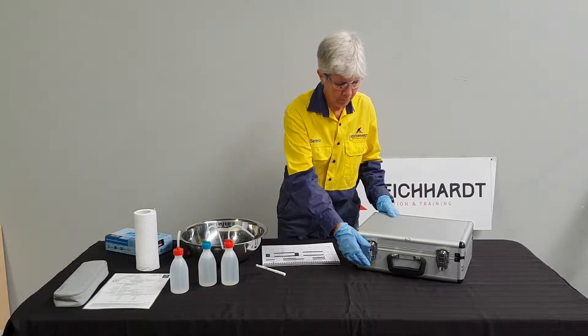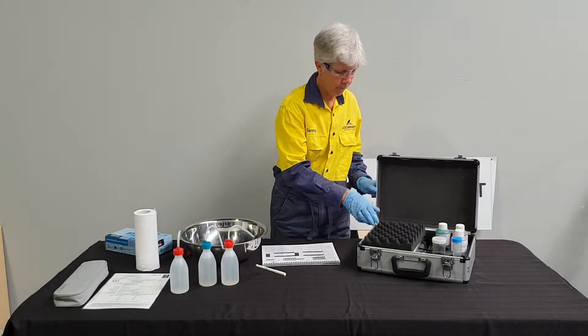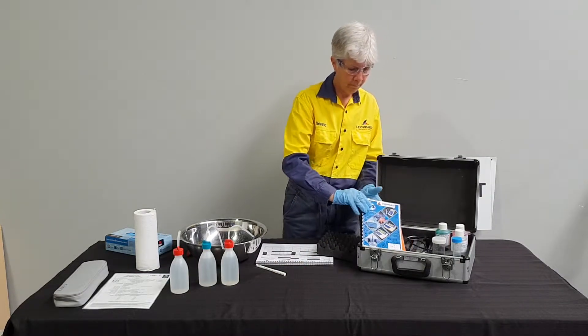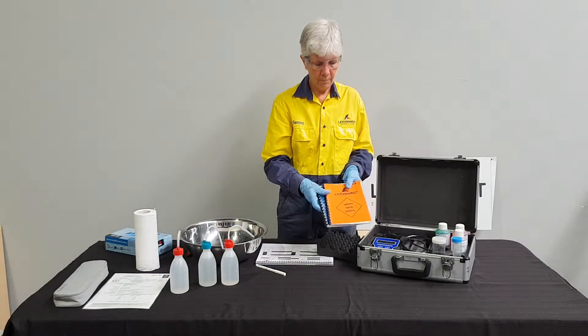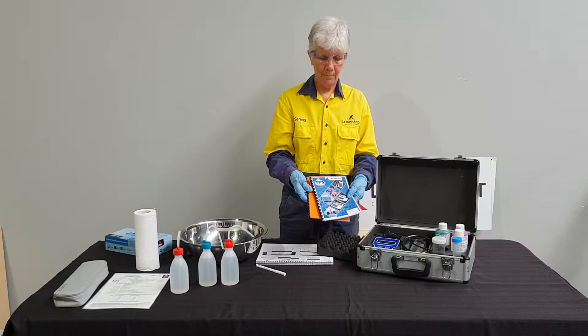Serena will now open the kit and remove the packing foam. Each kit contains two booklets. The first booklet is the safety data sheet. The second booklet is the operating manual.